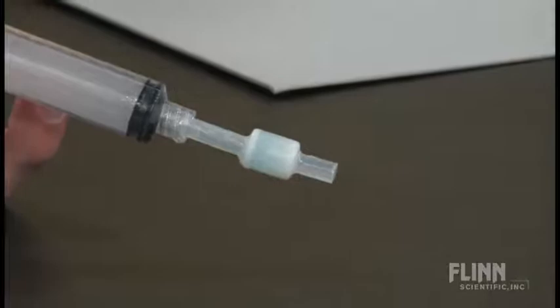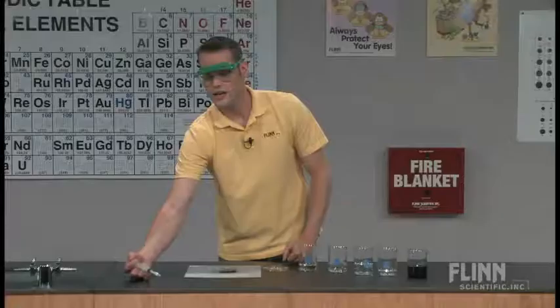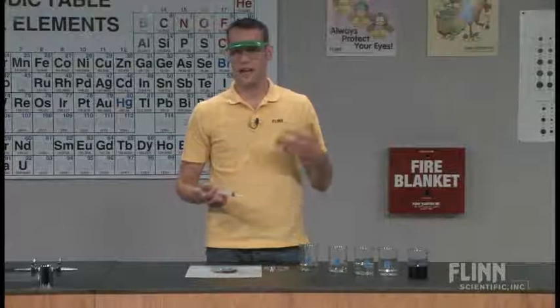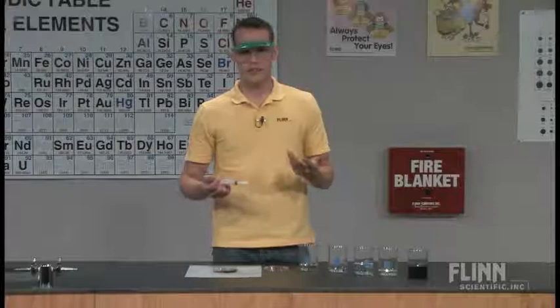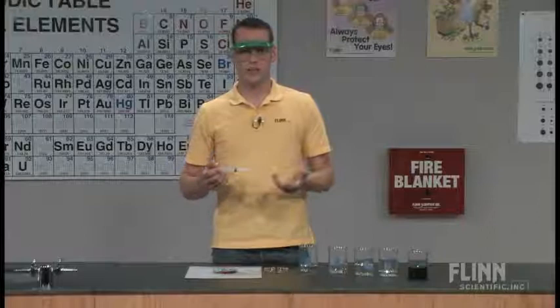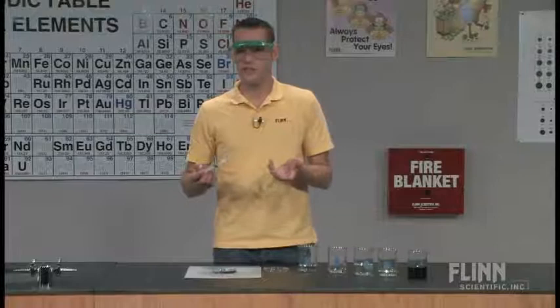Now, these can be cleaned and reused. I've had the same set the entire time that I've been at my school and I actually inherited them from the teacher who retired before me. So these can be constantly cleaned and reused. The cleaning instructions are in your handout and you just clean it with some more water, some more isopropyl alcohol, push some air through it, and then just let it sit on the shelf. The only thing that I ever use this for is for this demonstration or laboratory. So these can easily last you a very long time. I'm going to go to the board so we can talk a little bit more about what's happening inside the separation here.